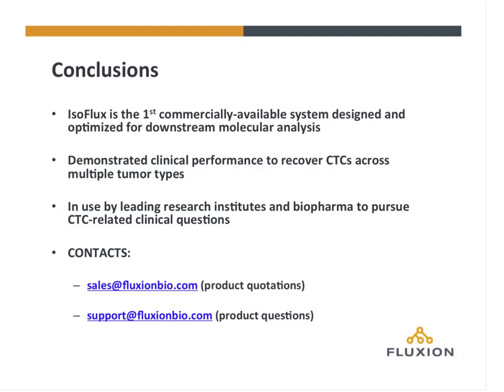But the simplest and most effective method is what we call the direct method. And this involves taking your antibody and direct coupling that to our IgG bead. And this has the advantage of better sensitivity, but also allows you logistically to prepare your beads ahead of time in a larger batch, which will just keep more consistency as you run any number of samples from that batch.